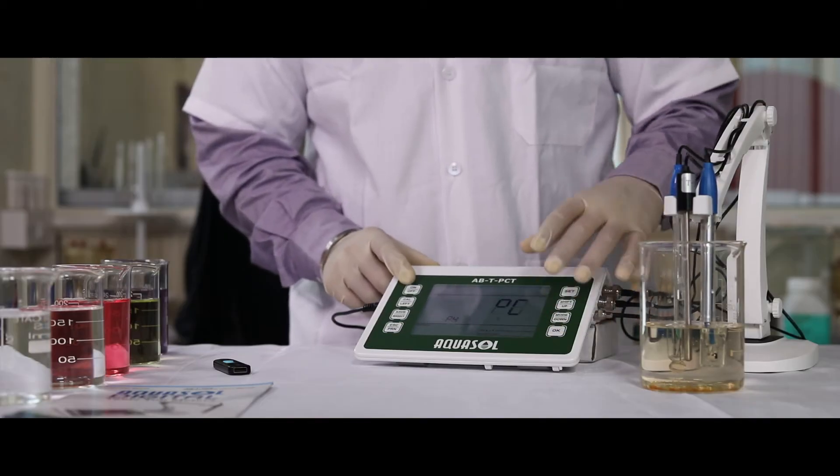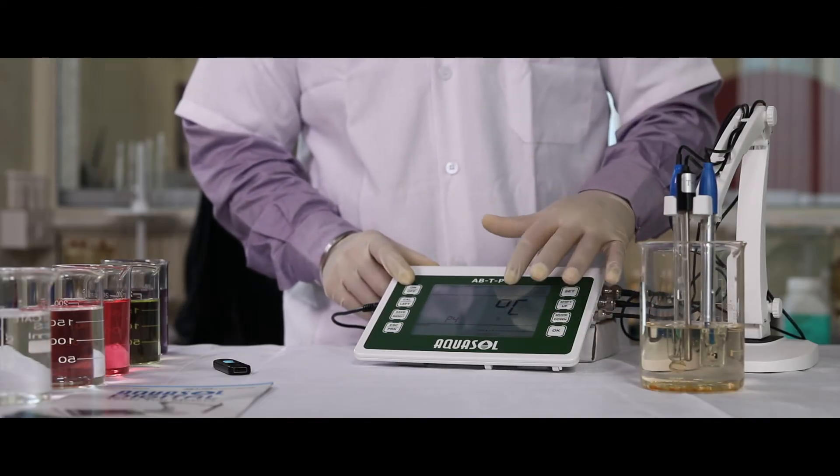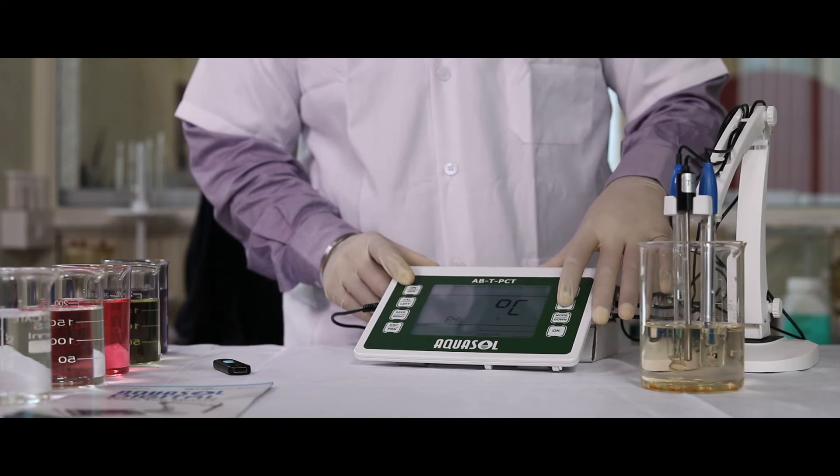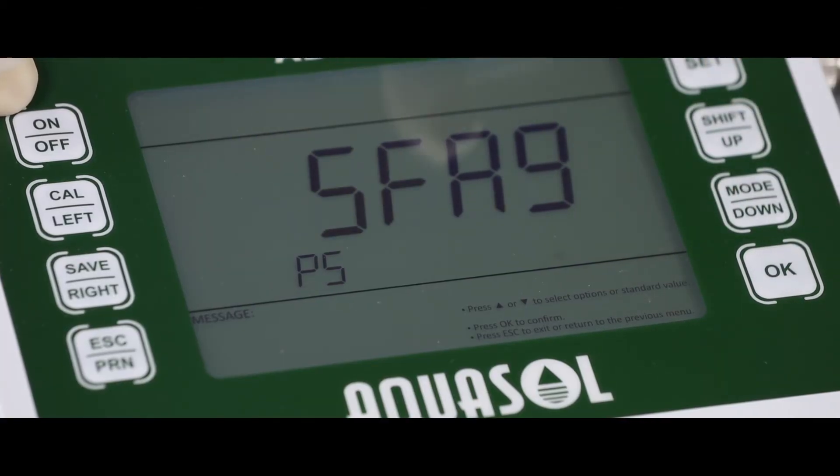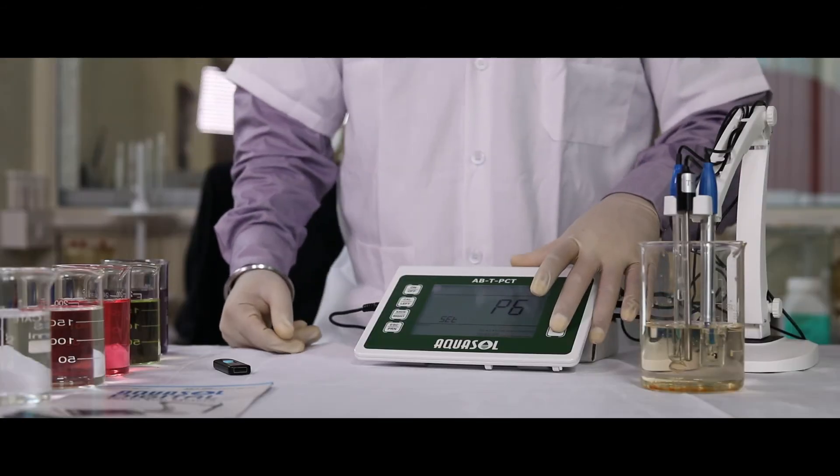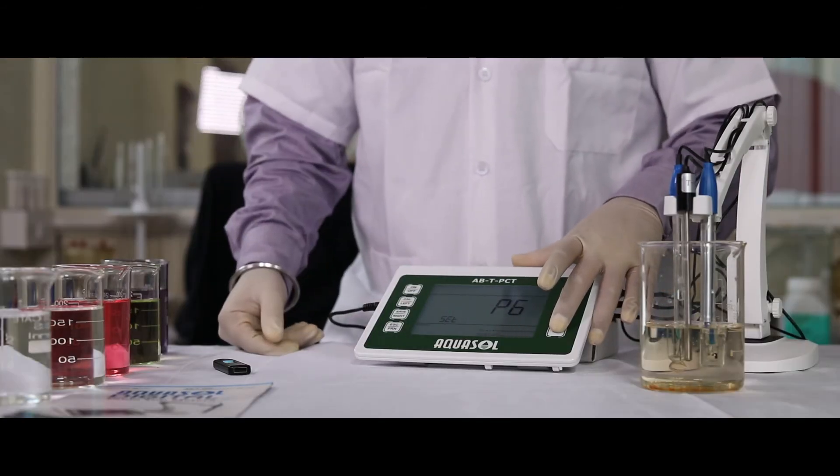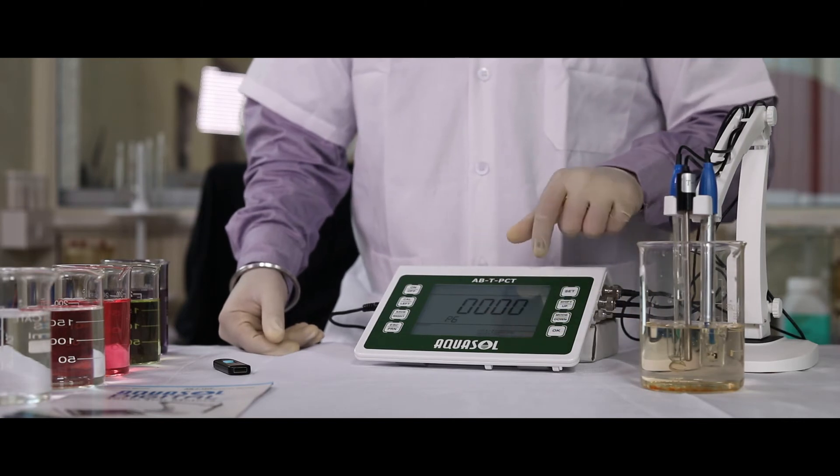P4 to change the unit of temperature. P5 is the meter code. P6 is the authorization code for the Bluetooth app.